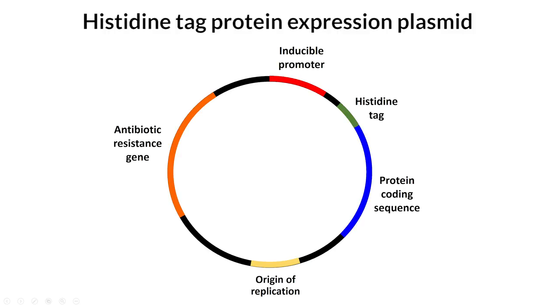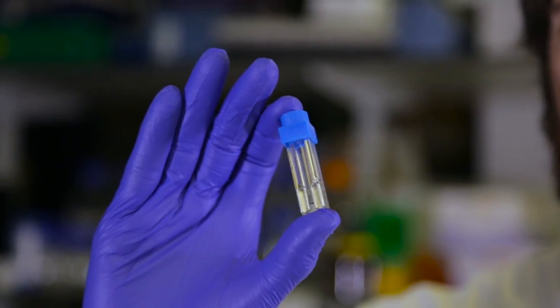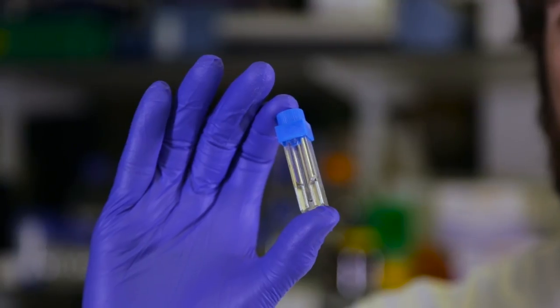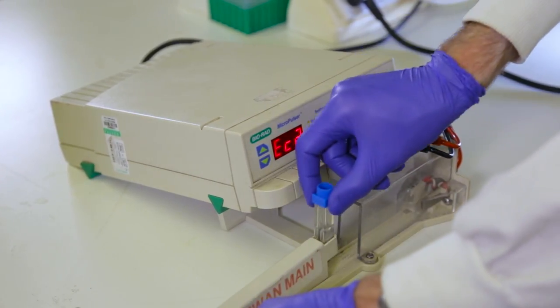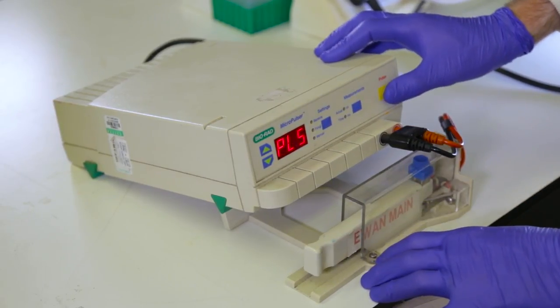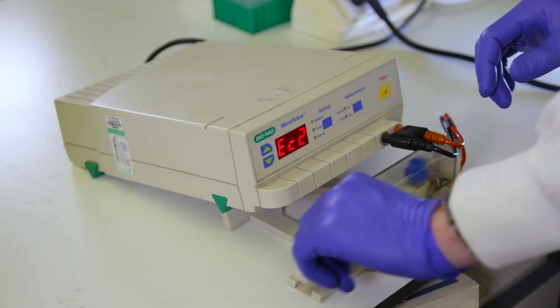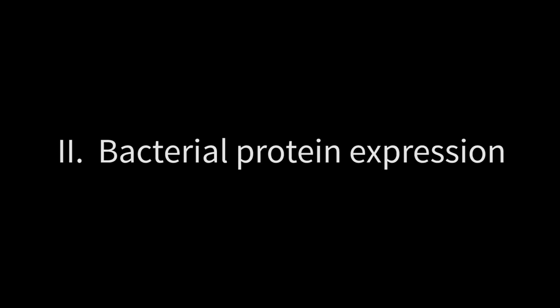The plasmid will be transformed into our production strain using electroporation. This is an aliquot of electrocompetent C41 cells. I've already mixed my plasmid in. We're going to put these in the electroporator and pass a high voltage electric current through the cells, creating transient holes in the cell wall. This will allow the plasmid to move into the cell and be taken up. We'll then select for the cells containing our plasmid and use them to express our protein.